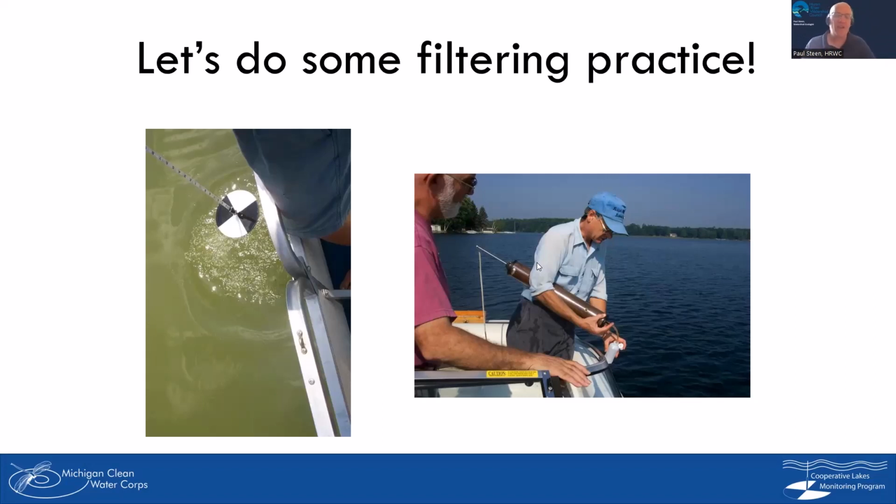So it's not that they're actually counting algae cells, but they're dissolving it all in the standard procedure that they use at the lab. But it is 50 cc's, so it's always a standardized amount, which is needed to make sure you're always comparing the right things to each other across the whole program.